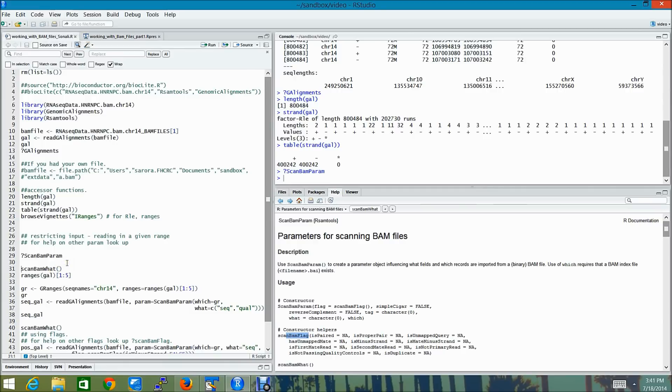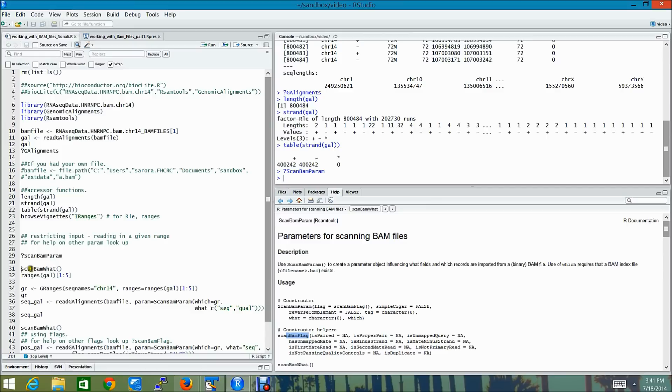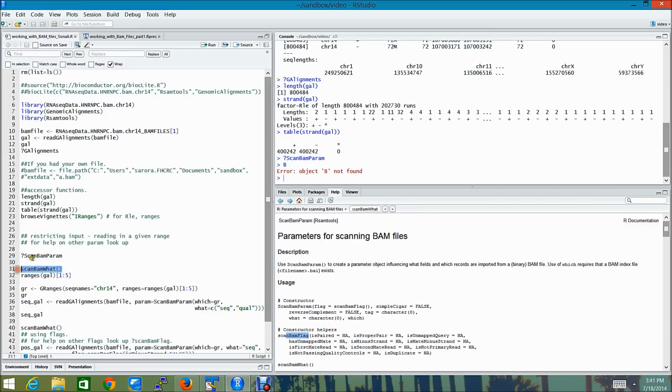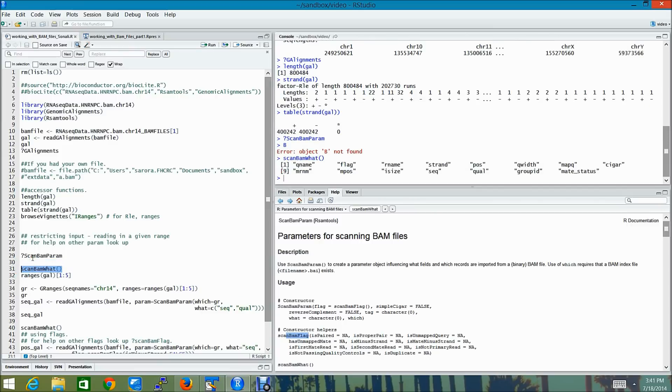So I'm going to show you an example here where I want to read in reads from a particular region. And I want to read in the seq as well as the qual read parameters apart from the default columns. To find out all the columns that you can read in from the BAM file, one can use scanBAMWhat. So these are the various fields that you can read in from a given BAM file.